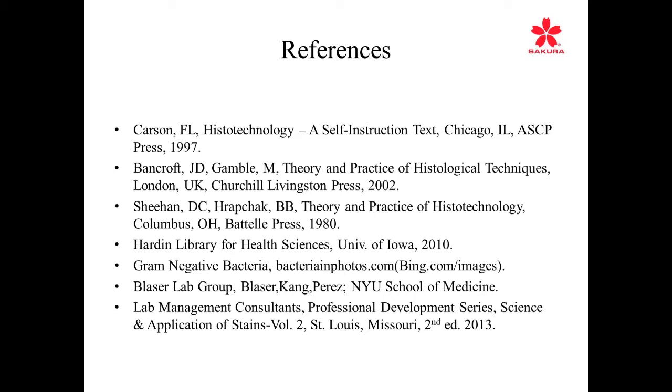Many times the pathologist can look at an H&E and they can see tuberculosis bacilli in there, but the confirmation of that comes when they do the special stain. And the pathologist will rely on the technologist to give him the special stain that will actually visualize that organism and nothing else.